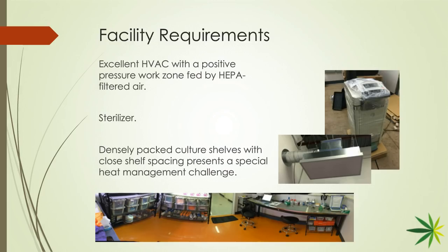Now, going back to the filtering, I wanted to point that out because it's an important consideration. You see the door is open at the moment. When this room is in full operation, that door is closed, and there's just a vent at the bottom of the door. You've created what's called a positive pressure work zone. What that means is that the fan on the HEPA filter unit is pulling in some air from outside, and it has nowhere else to go except out through that grate in the door. So there's a positive flow of air outside of the room.